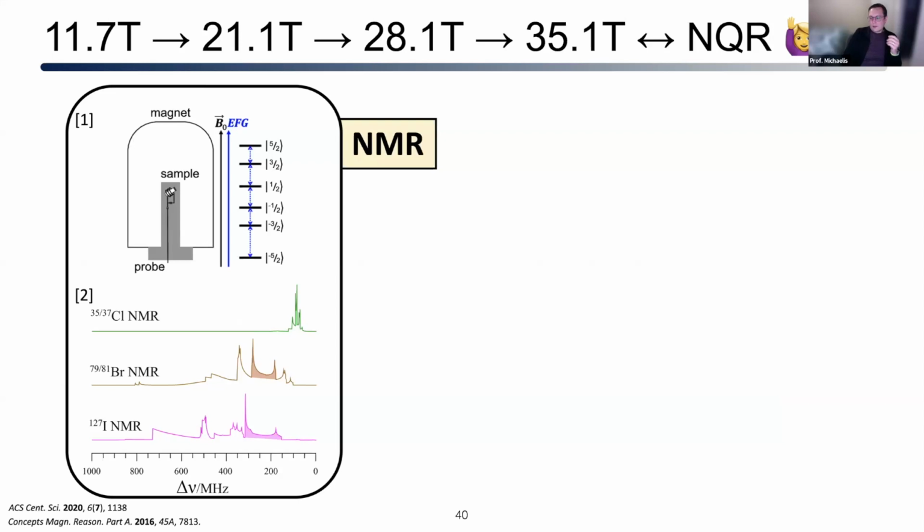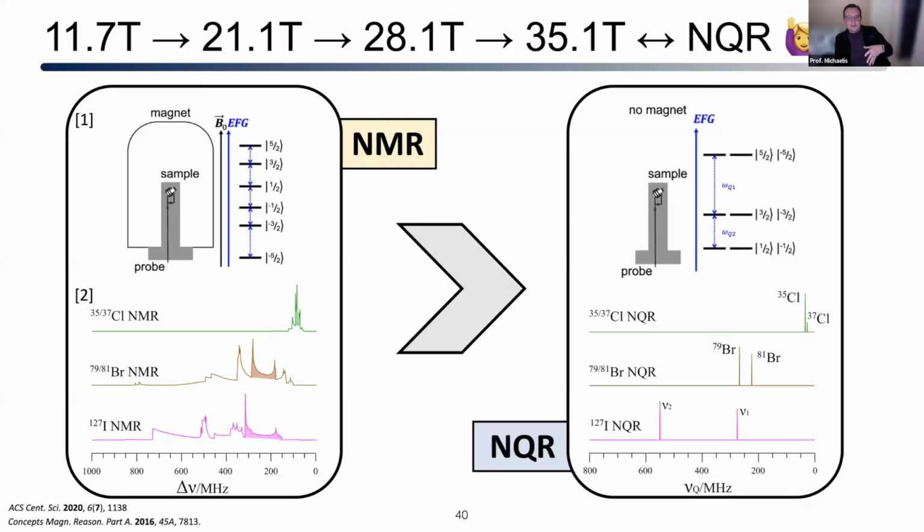All right, going on from there, the problem we have is that sometimes we might want to look at the actual halogen environment. For the most part, we've been focusing on NMR for all these systems, and there's good reason for it, because you get not only chemical shift, dipolar and J coupling information, you also get quadrupolar information if it's relevant. The problem is that for chlorine, bromine, and iodine, although they're all NMR active, you have different challenges associated with them due to their overall quadrupolar moment.